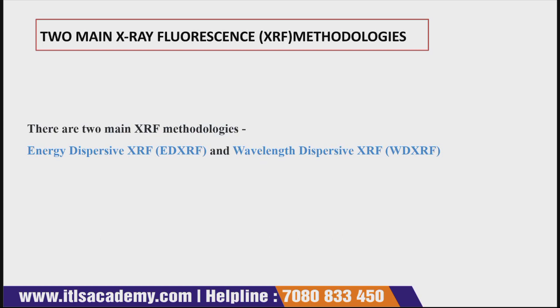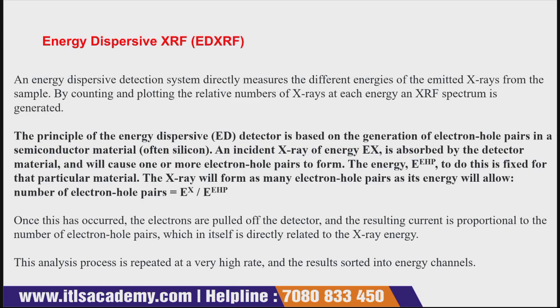Basically there are two methodologies of X-ray fluorescence spectroscopy. The first one is energy dispersive and the second is wavelength dispersive. So let us discuss each methodology in detail. First we are going to cover the energy dispersive X-ray fluorescence spectroscopy, then we will discuss the wavelength one.